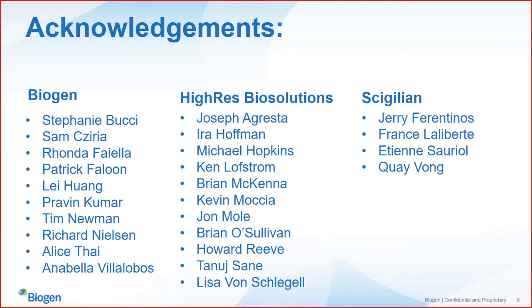So what we do is all of our assay ready plates are sealed at the end of making them. And then we move them offline and we vacuum seal them into plastic bags, and they're usually good for about a month at that point, at least. It depends on the sample, but we typically use those up within a month. I've made samples and shipped them to our contract labs overseas, and they haven't been tested for a month at that point, and they've had no problems. That's a typical workflow for us.